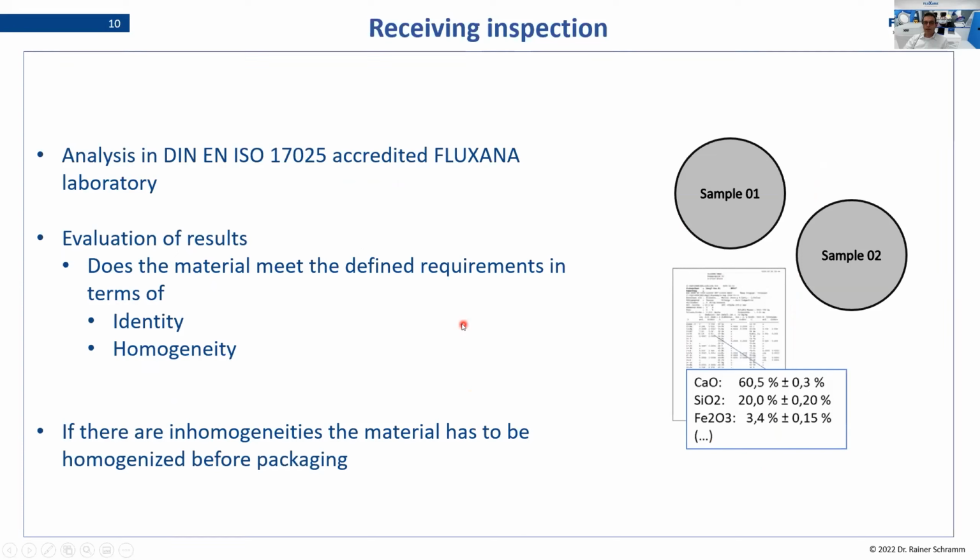Of course, we will send this to our laboratory, which is also working under accreditation, in this case ISO 17025. That means this laboratory is accredited for XRF and can do any kind of applications which are of interest in the XRF field. And this is important when you produce reference materials, that the final purpose where this material should be used is already the case when you analyze it.